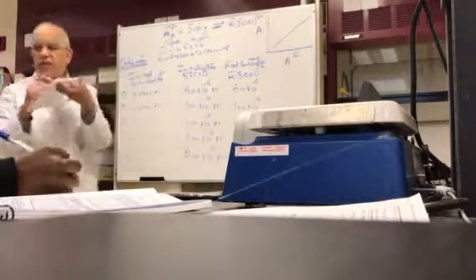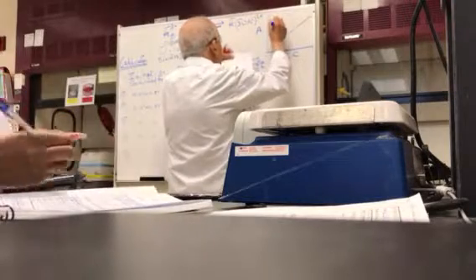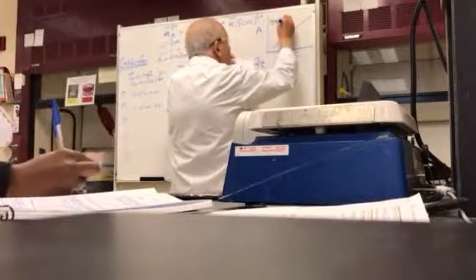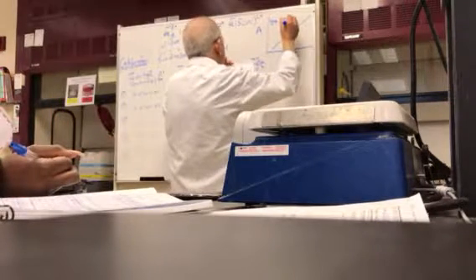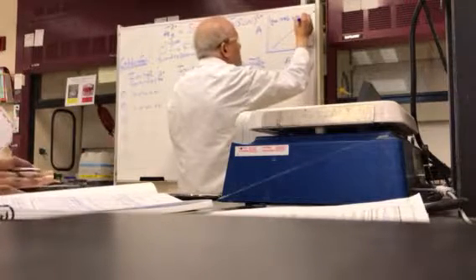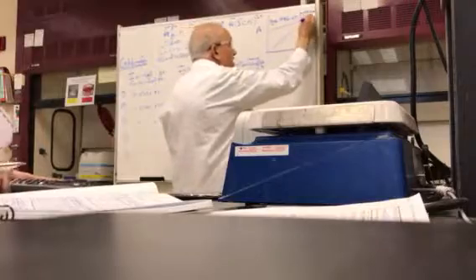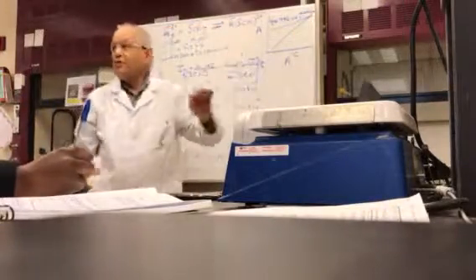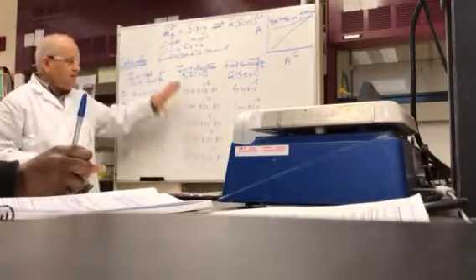Be sure to have the linear equation in your report. For example, for this one, and this is not necessarily what you're going to get, it is 1996.4x plus or minus 0.0599. Okay? We need this information for our equilibrium. So we finish our calibration. The whole purpose of that graph, that's how you do it.